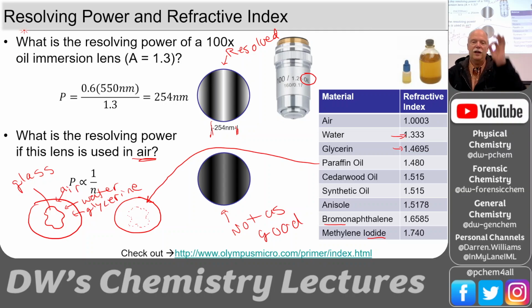And then if you have that's maybe on the victim, and then you have something from the car that you think they hit them with, you can look and say, well, these two pieces of glass have the same refractive index or not. You know, if it's not, then it's exculpatory. If it is, it's inclusive. And you can make a decision based on the refractive index of the glass. So this is a way to get a refractive index of a tiny little chip of material, if you can match it, and that's why we have these purified oils.